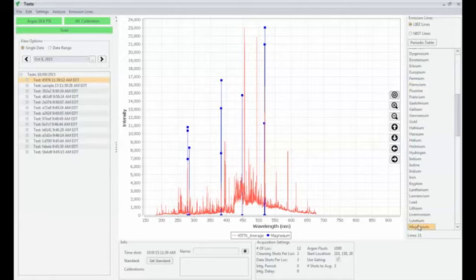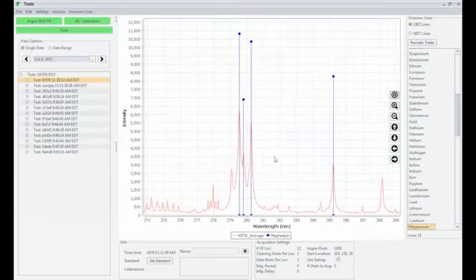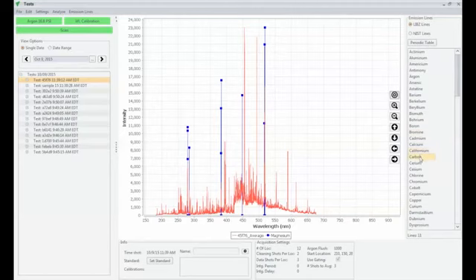So right now I've got magnesium selected, and we can see on the spectral plot it's showing us where the strong magnesium lines should be showing up in our spectrum. The height of these lines should also signify the relative intensity of each of the peaks in the spectrum. Look around, we can do this with any element we want.